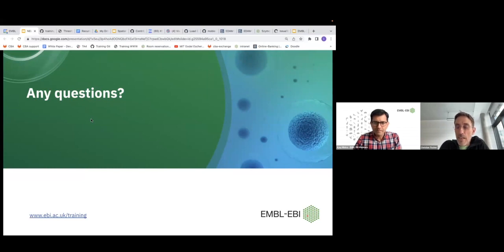Then the data type module would be useful because they have different data types, some of them are maybe RGB, others are 16-bit and so on. Then I think teaching modules about how to interact with multidimensional images can be interesting. For example, they can have three dimensions or multiple colors, like if you think about histology.